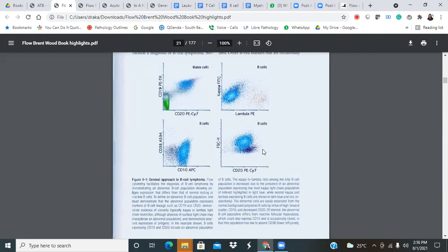Especially with this amount of forward scatter, it could be anything from the germinal center, like Burkitt or DLBCL. So when we see this, the reporting line is usually B cell lymphoma of germinal center origin, and that's where we stop. We usually say abnormal CD10 positive B cell population identified, and then mention all the aberrancies, and then we say correlation with the bone marrow or the lymph node. Basically it could be anything, as you said: Burkitt's, diffuse large B cell, follicular.